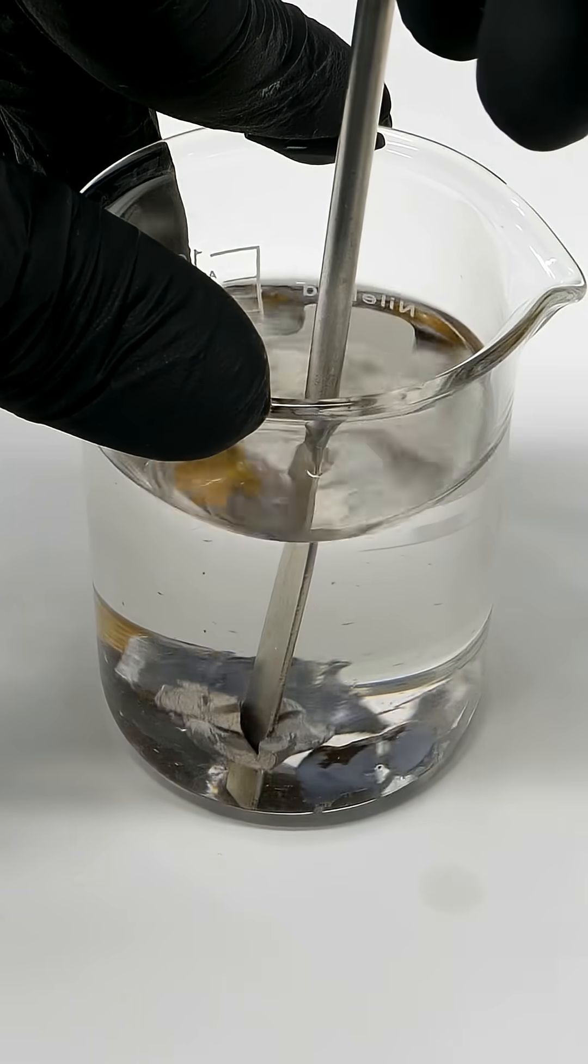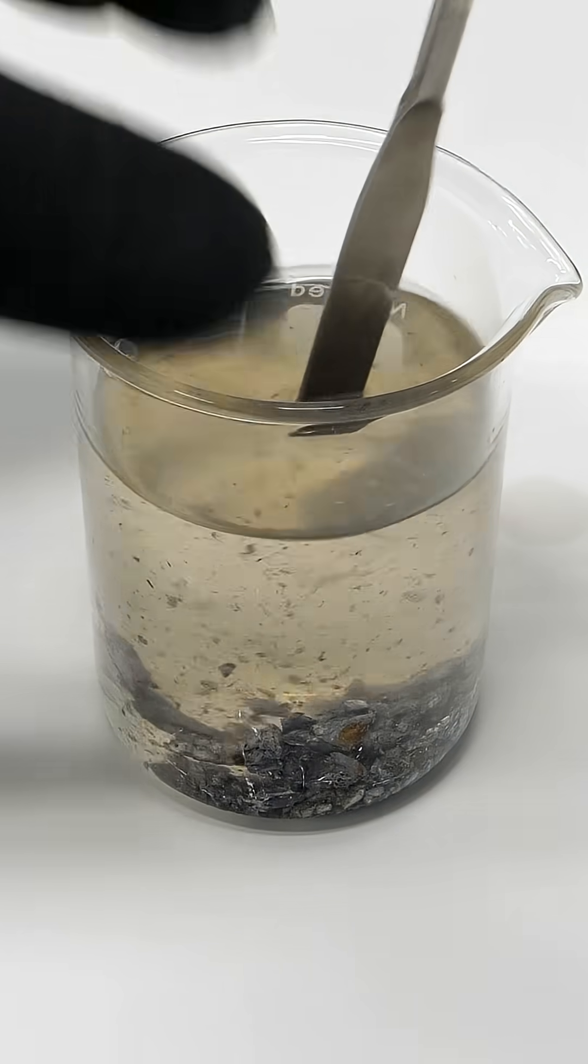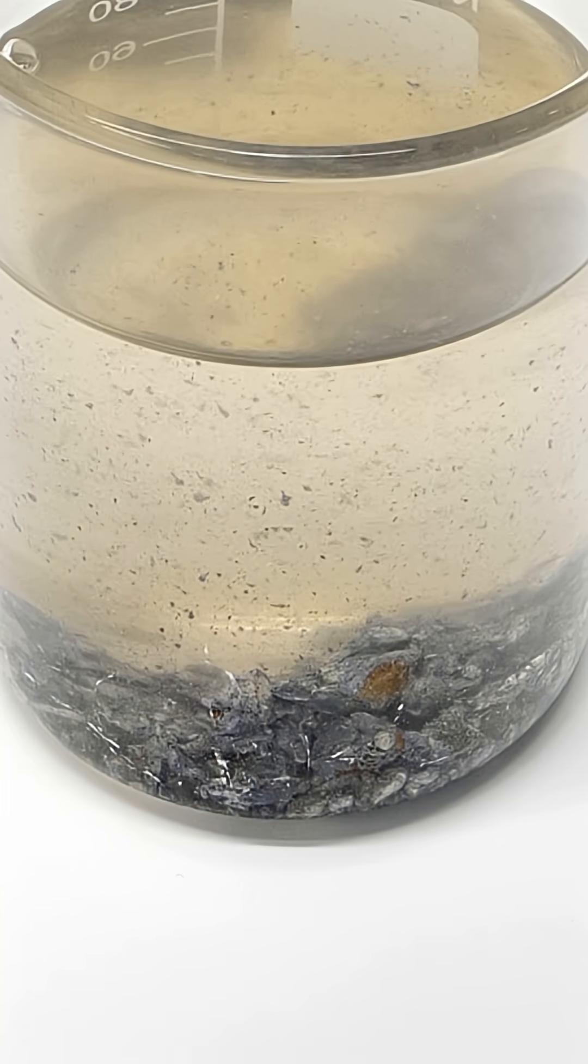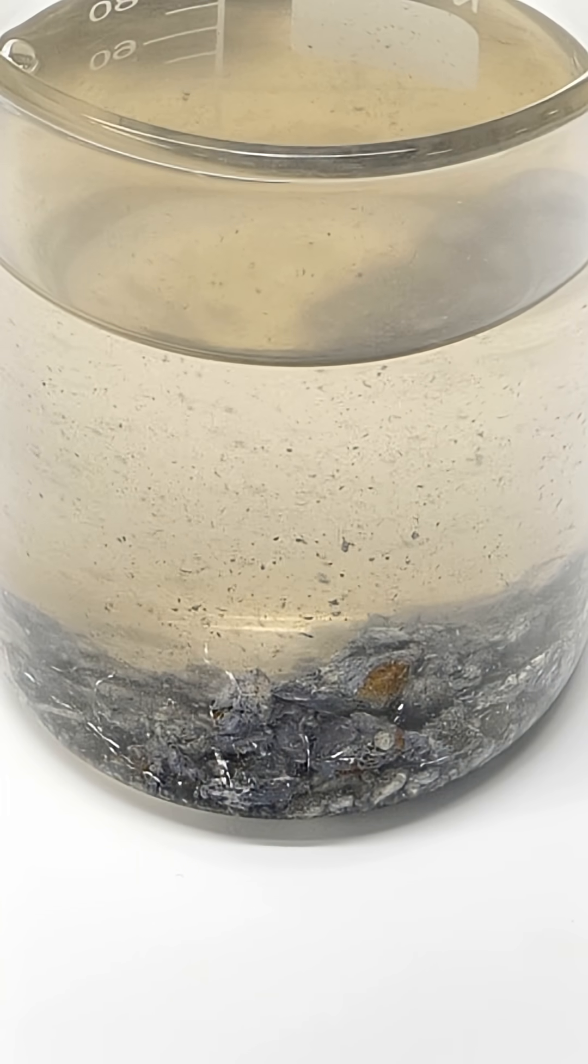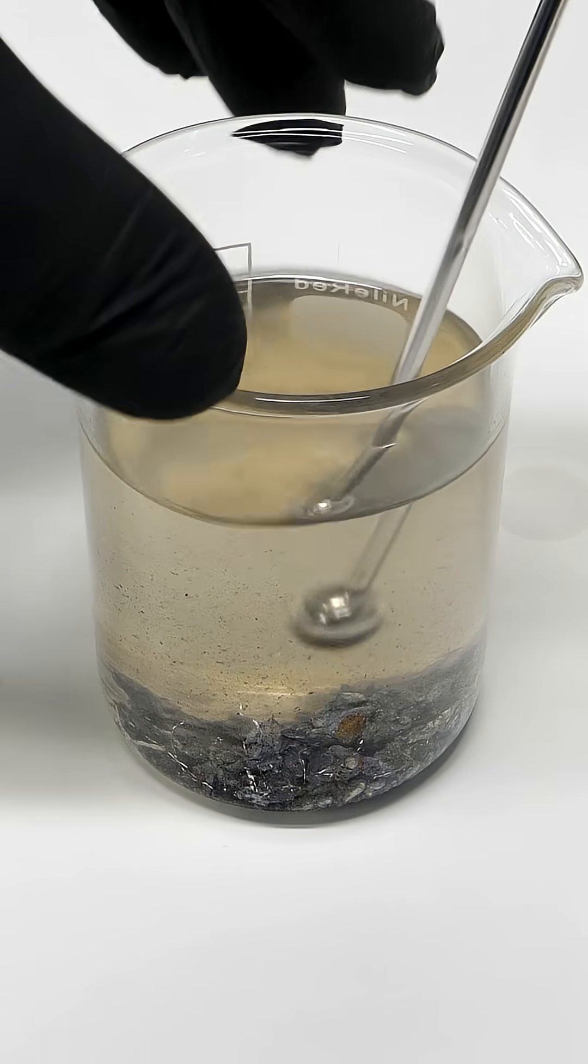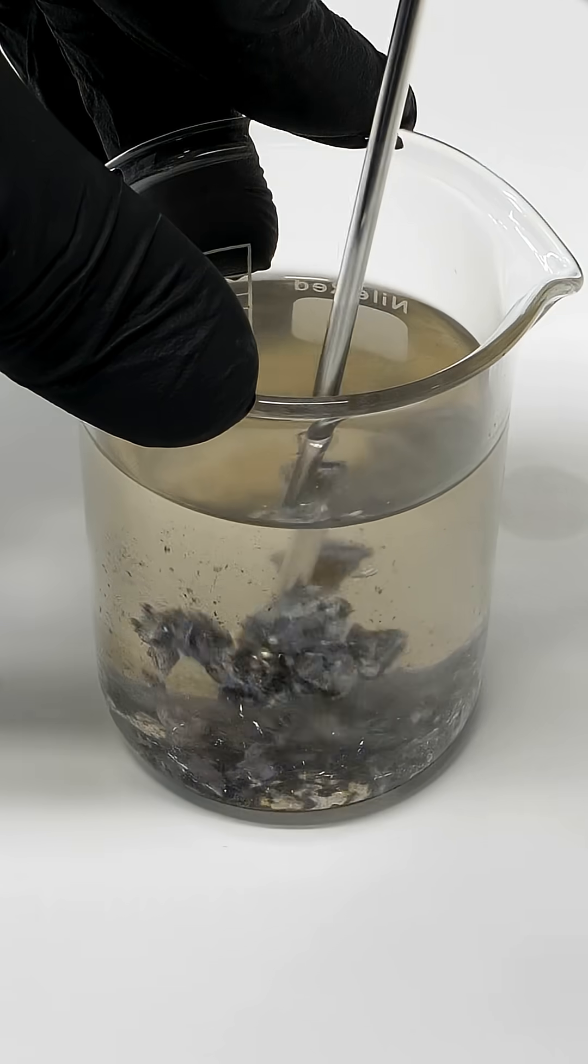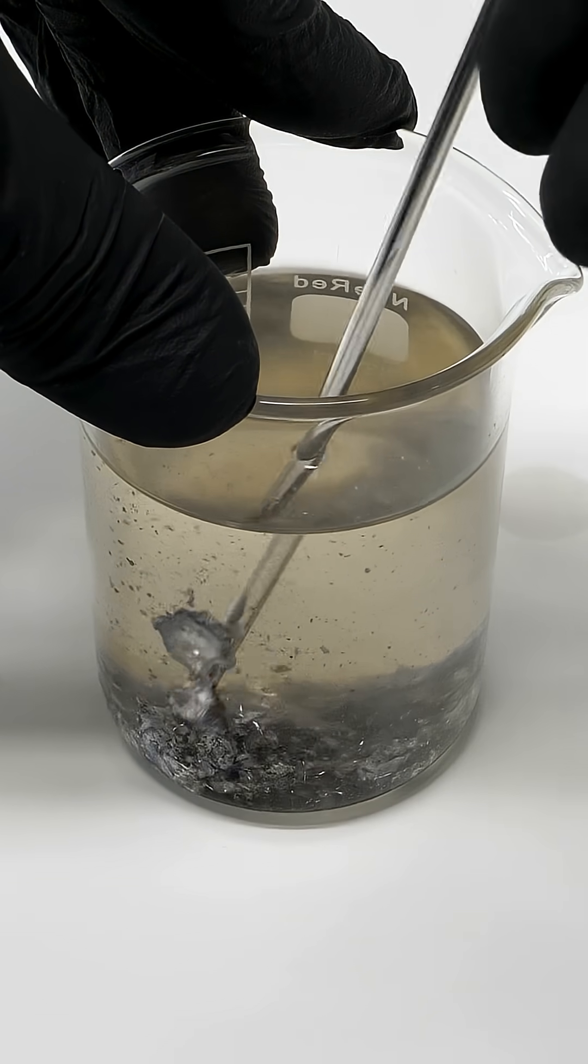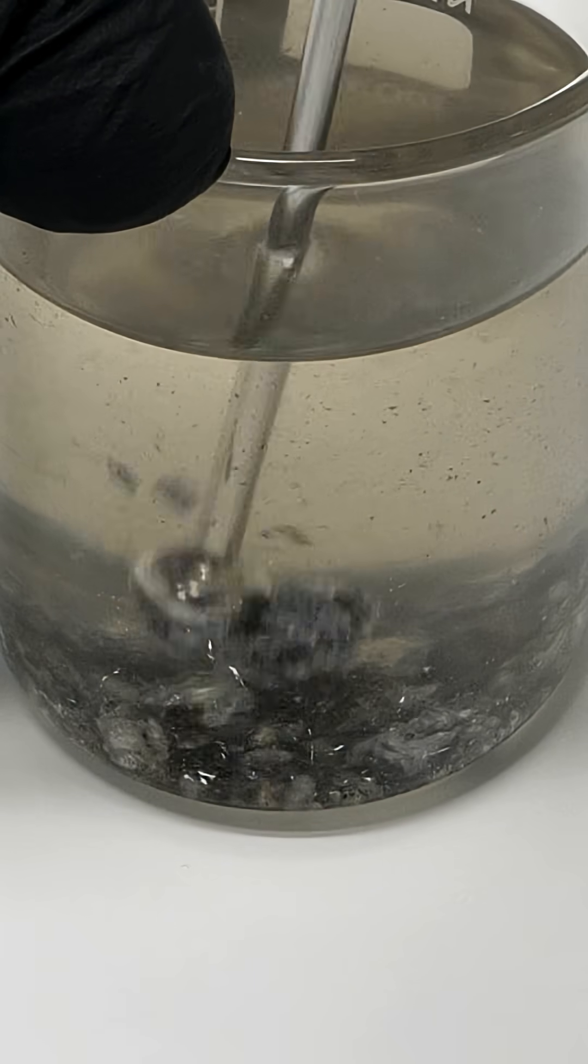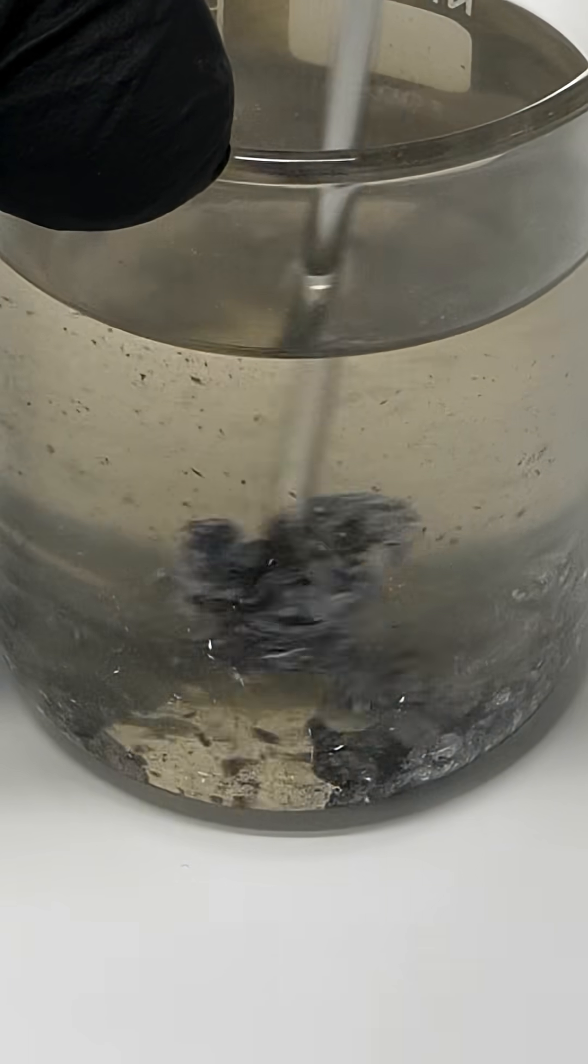It took a few minutes of stabbing, but I was eventually able to break them into a bunch of small pieces. At this point, it just looks like a pile of junk, but this should change when I start squishing it. Using this other tool, I can squeeze the pieces together and hopefully force the sodium and potassium to combine. This should make a sodium and potassium alloy, also known as NAK, which is a super reactive liquid.